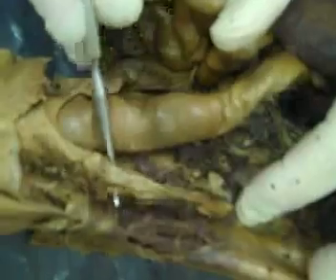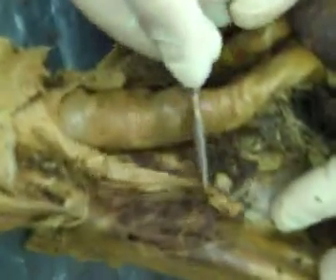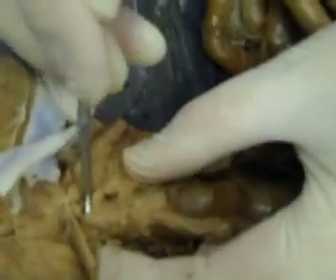Let's do the female organs. So, here is the... That's ovary, I know. That's the ovary. Right there. This is the horn of the uterus. There's another horn of the uterus over here, another ovary over here, and where the two horns come together, below my probe, that's the uterus. On my photograph that I showed you, we traced the uterus down even farther, and we saw a tube. That was the vagina. That's right here.